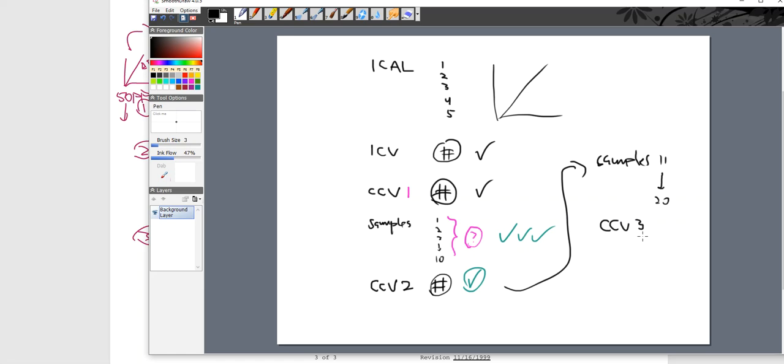And just as before, I get a number. Does that number fit in the window threshold of a plus or minus 10%? If it does, woohoo! Party time! I get to pass all of samples 11 through 20. One step in the right direction. Absolutely, we keep on trucking. Feel really good about it.